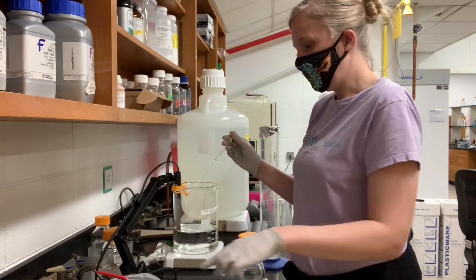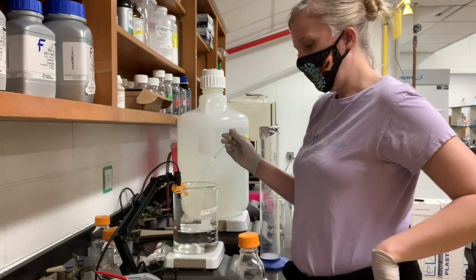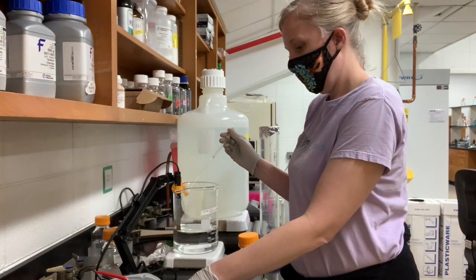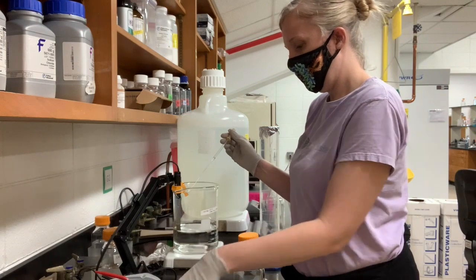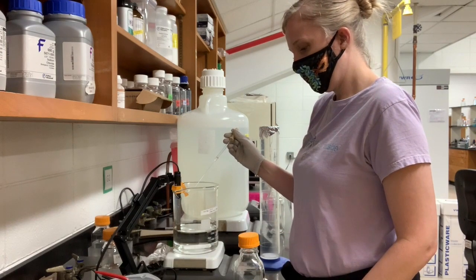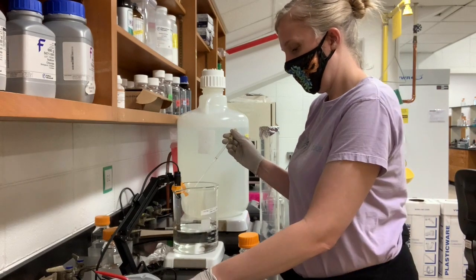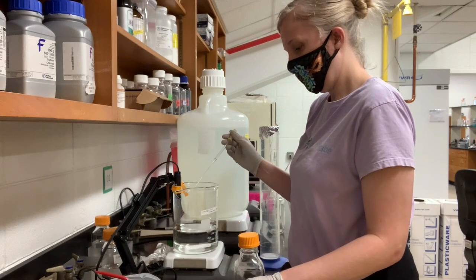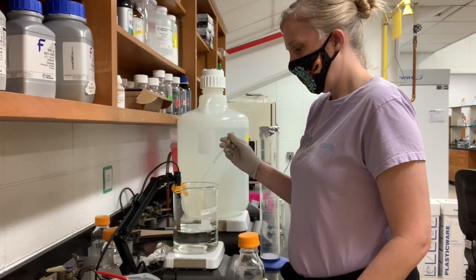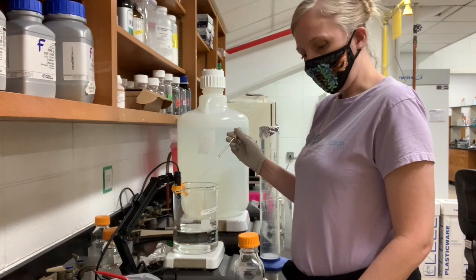So I'm pretty close at 7.38. It went to measure, or it went to ready. So I'm trying to get it to measure again. Just one more droplet and see if I can get right at 7.4.